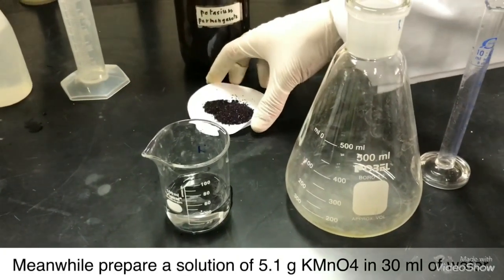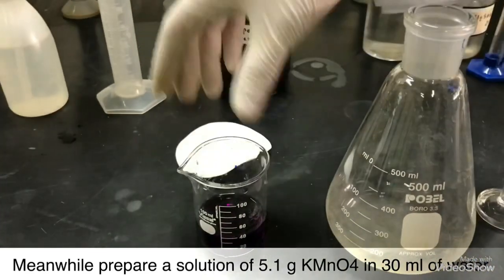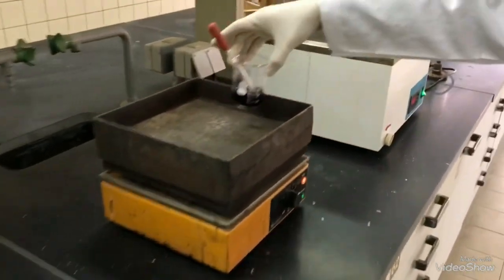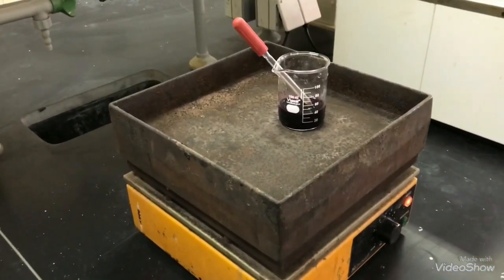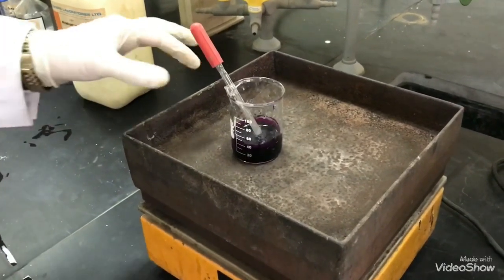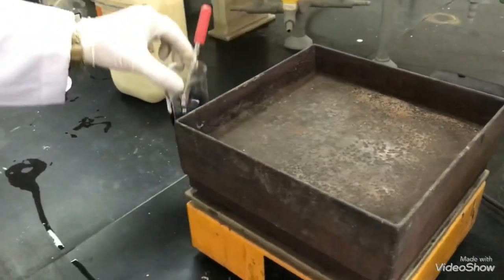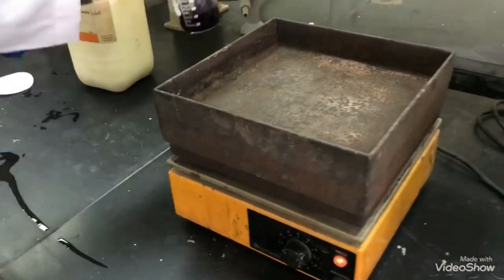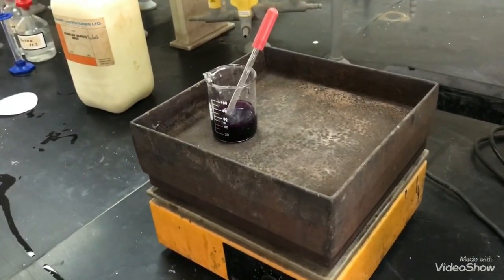Now, start preparing a solution of 5.1 grams potassium permanganate and 30 ml of water. Put it on the hot plate and start heating till boiling. Make sure that your permanganate mixture is not boiling for more than 1 minute. If so, remove it from the hot plate, put it on your bench for 1 minute, and then return it back to the hot plate in order to avoid evaporation of water and then precipitation of permanganate.